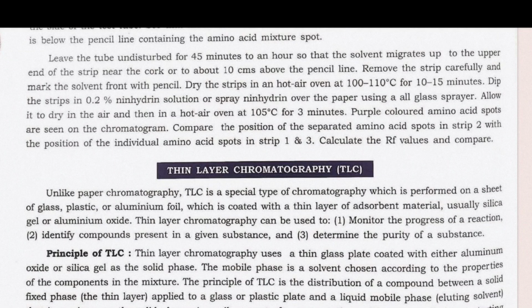Leave the tube undisturbed for 45 minutes to an hour so that the solvent migrates up to the upper end of the strip near the cork, or to about 10 cm above the pencil line.